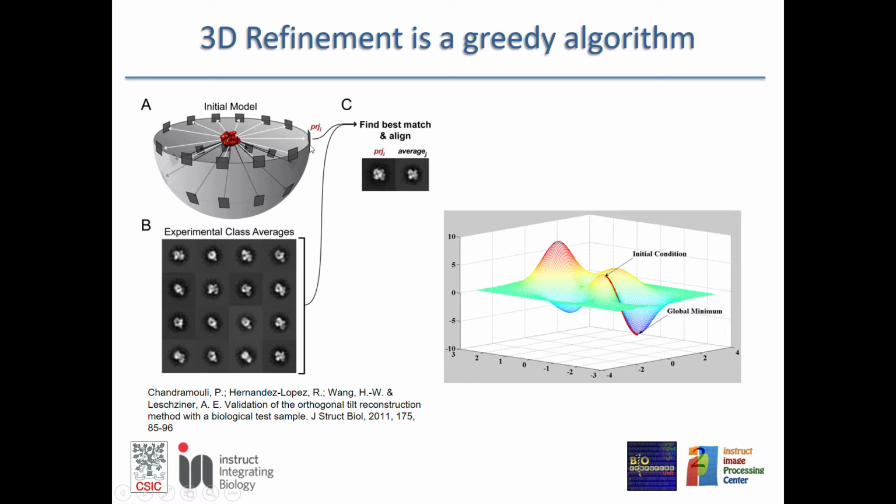And then you take the direction from this reprojection, so this line here, you get how you generated that image, and then you invert the process so that now you take all the experimental images with their associated alignment parameters and make a new 3D volume by just applying a 3D reconstruction algorithm, and then you have a new model, and you iterate this process once and again.